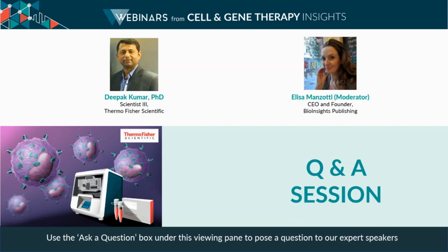Great. And another couple of questions in from the audience. So what platform did you use to expand your cells with NK-Xpander Medium? So we use here our G-Rex. We have the G-Rex culture media platform. And we also have the normal plate, but G-Rex gives the best result.